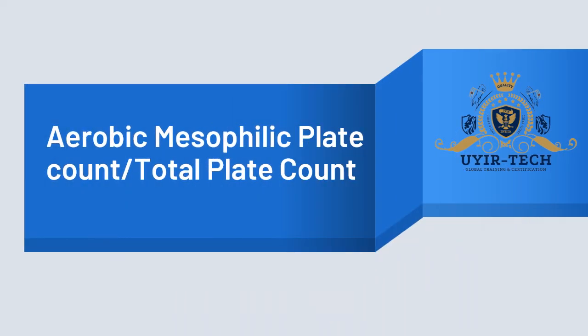Aerobic plate count, or aerobic mesophilic plate count, or total plate count techniques. That is a basic enumeration method. These techniques are used to indicate the microbial counts for quality assessment of food products.